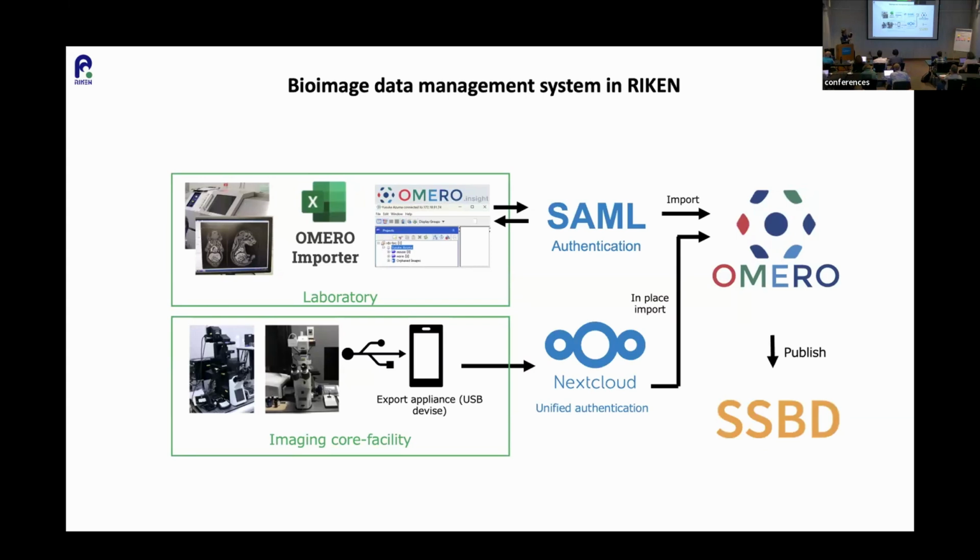So the idea is to put the data from the laboratory and imaging into the centralized data management system, with the data hopefully added automatically or very efficiently. The instrumental setting metadata can be automatically drawn by using the Bio-Formats format for others. That is okay, but for the more difficult experimental setting data or something.